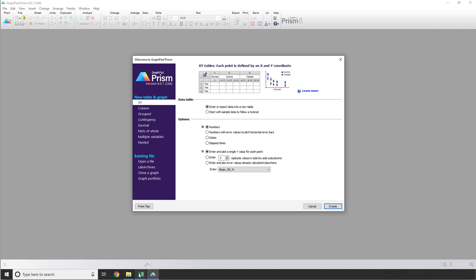Another thing I'd like to point out is that, at times, this video will assume that you're somewhat familiar with the concept and structure of Prism's data tables. If not, you can watch our video on the eight types of data tables in Prism to learn more. So let's get started.